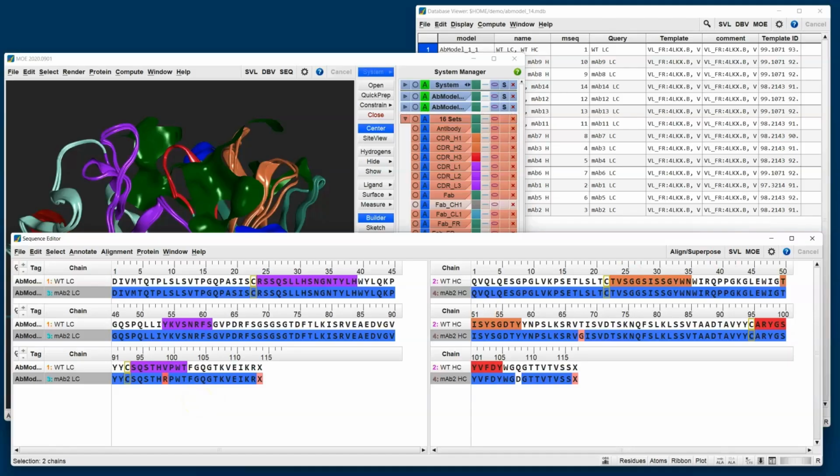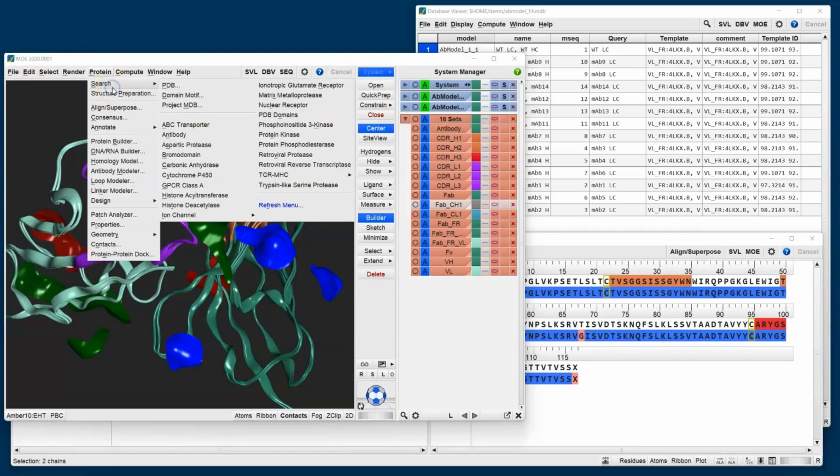So that brings us to the end of today's session. Today we've been modelling and analysing an antibody to find liability motifs and the risk of aggregation using our selector. We then compared the wild type to other antibodies using the project search. Upon finding that our wild type had poor developability, we then modelled 14 candidates. We analysed their properties, we rank ordered them, and we selected the most promising candidate with a lower hydrophobic patch area, which we hope would have improved developability experimentally.